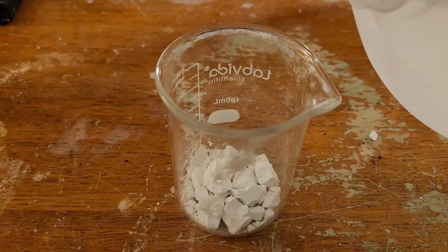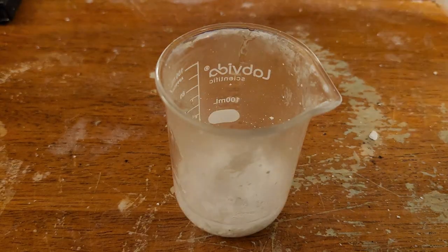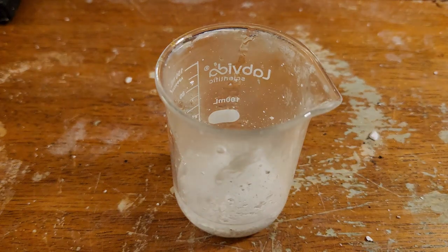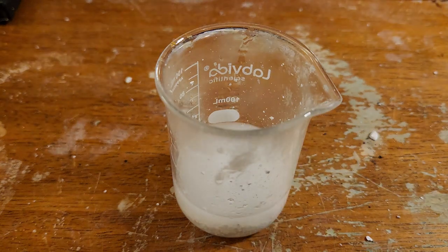This process is called slaking, where calcium oxide reacts with water to form calcium hydroxide. Let's try it again with a bigger batch. As you can see, the reaction can be pretty violent — with the right ratio of water the temperature can reach as high as 300°C. This reaction throws blazing hot bits of lime all over the place, so safety glasses are a must.